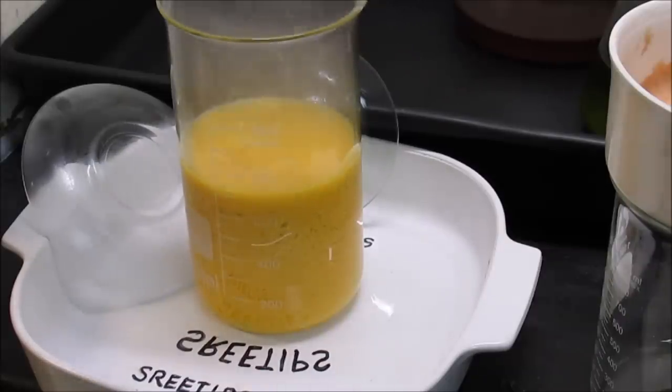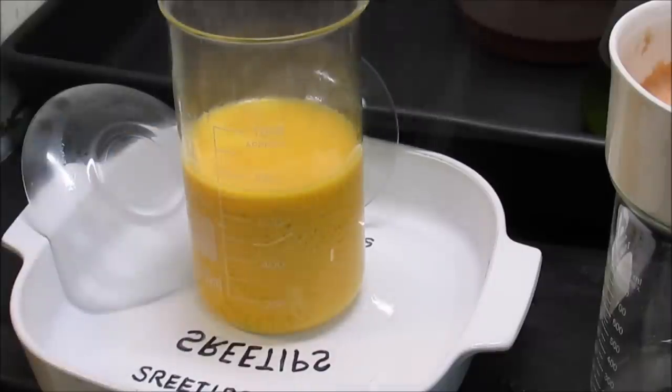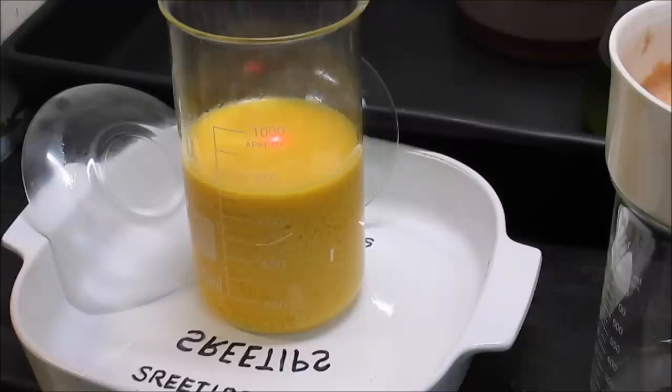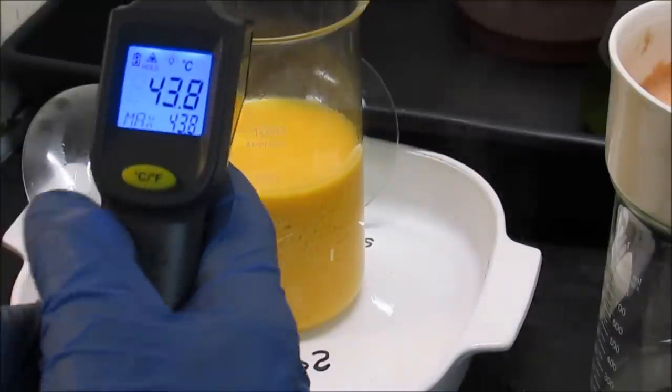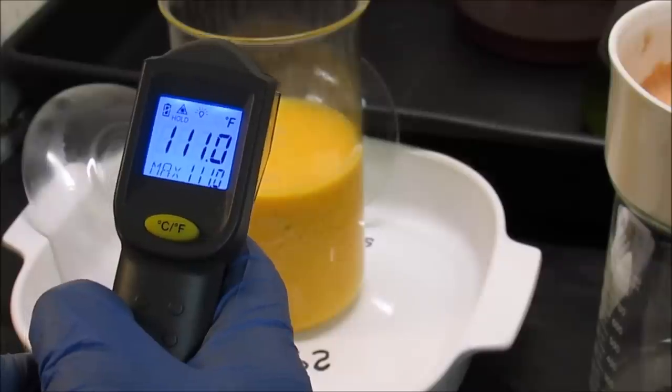That was just the right amount of hydrochloric acid to add. The solution is a little bit warm. Temperature reads 43.8°C / 111°F.